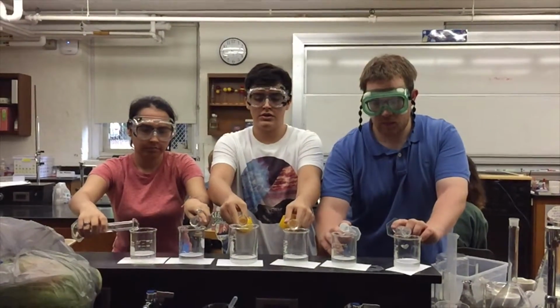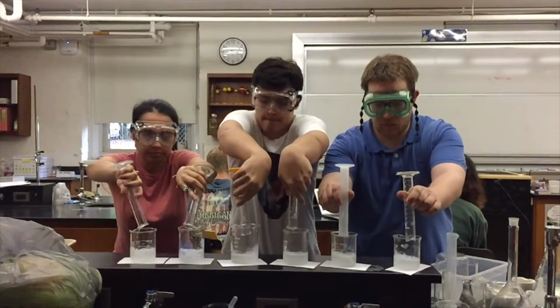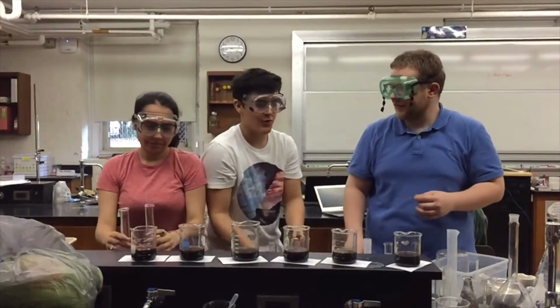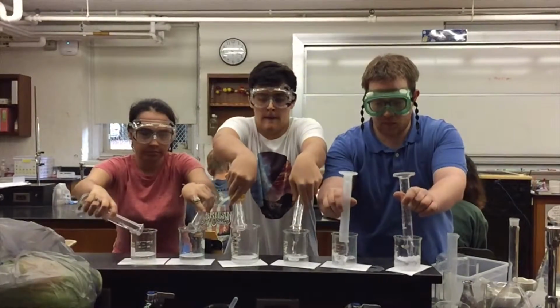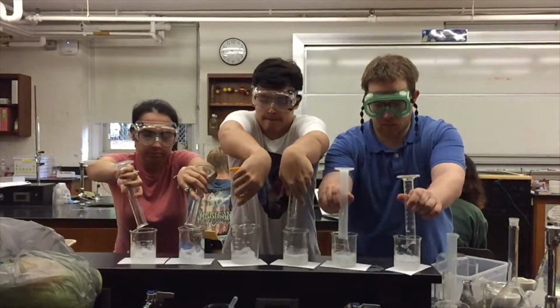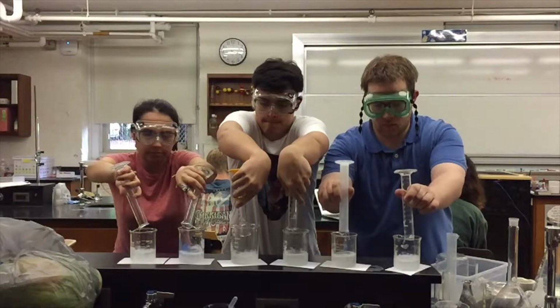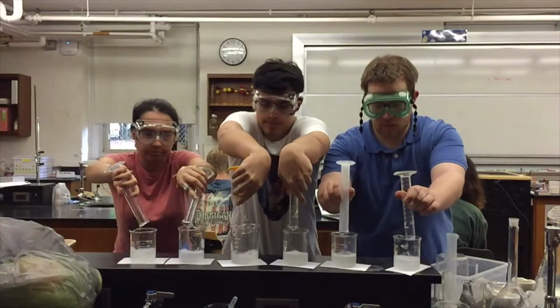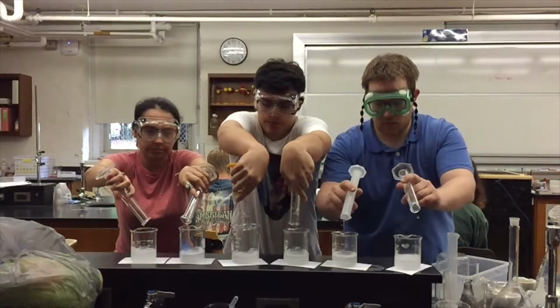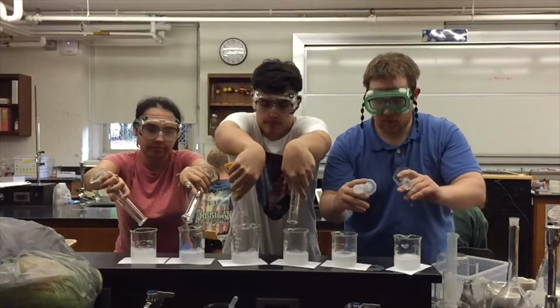Now that we've broken down the experiment, we will try it with 6 different concentrations of potassium iodate. As you just saw, this experiment shows that the concentration of our solution is directly related to the rate of the reaction, showing that the more concentrated the reactant, the faster it will occur.